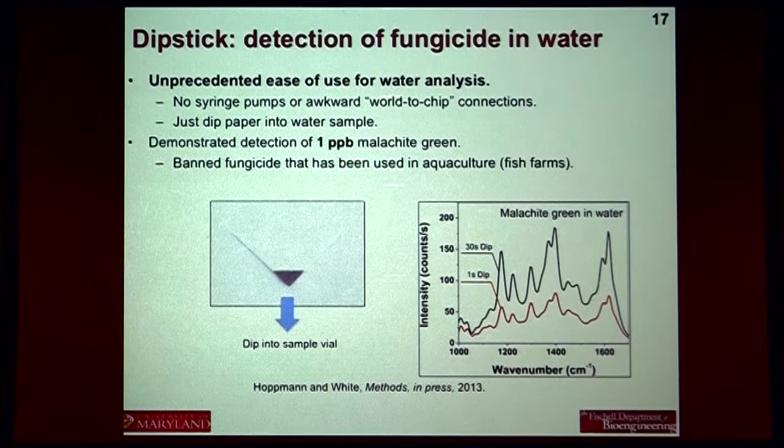It's sometimes fun to imagine the analog for either the silicon devices or microfluidic devices. So I've got a microfluidic sensor and I've got water and I have to figure out how I am going to get this water into this little spot. So there's this classic world-to-chip interface problem that the microfluidics people always have to think about. I've got pumps, I've got interconnects that have pressure limitations and leakages and so forth. Paper, I just literally dip it in the water and I measure it. In terms of how long this takes, 30 seconds is basically your answer there. Or it could take 1 second if the concentration's a little bit higher.